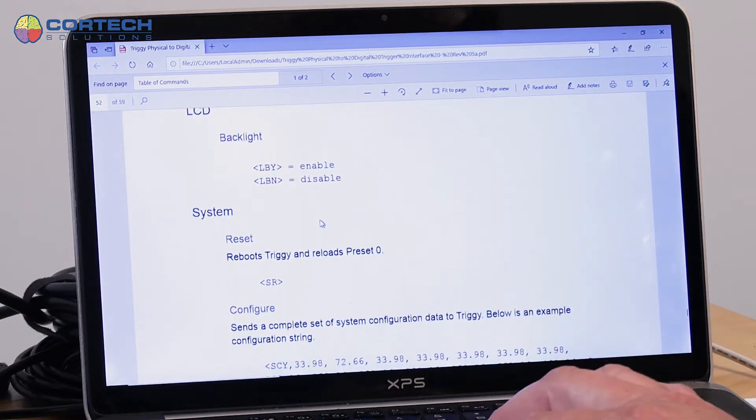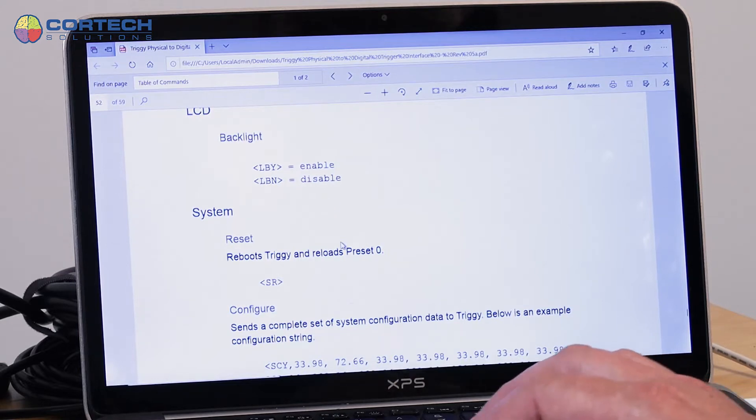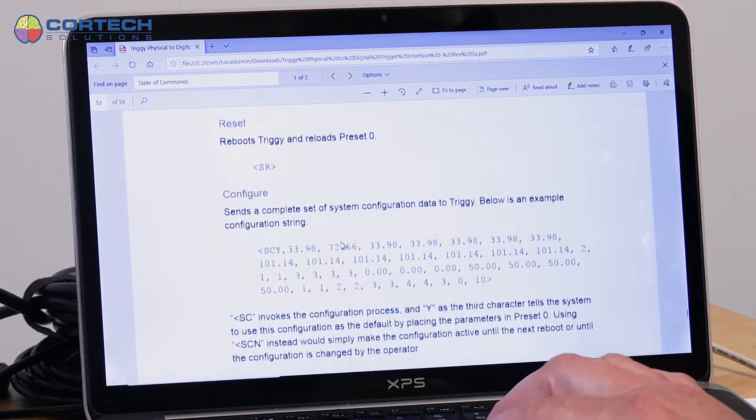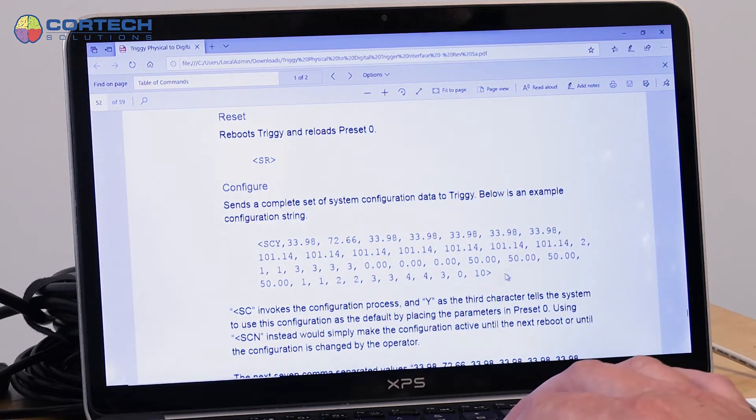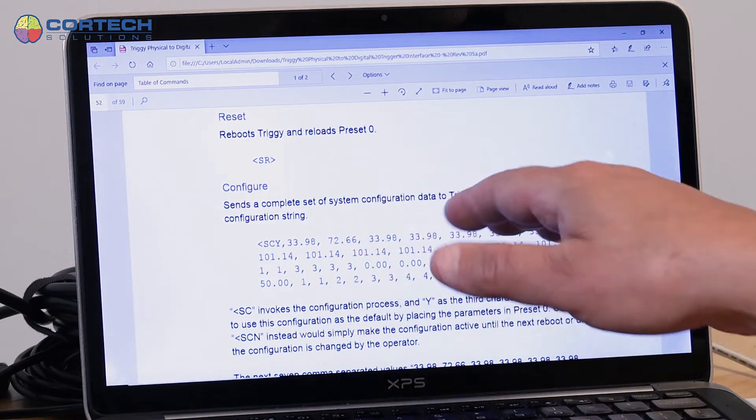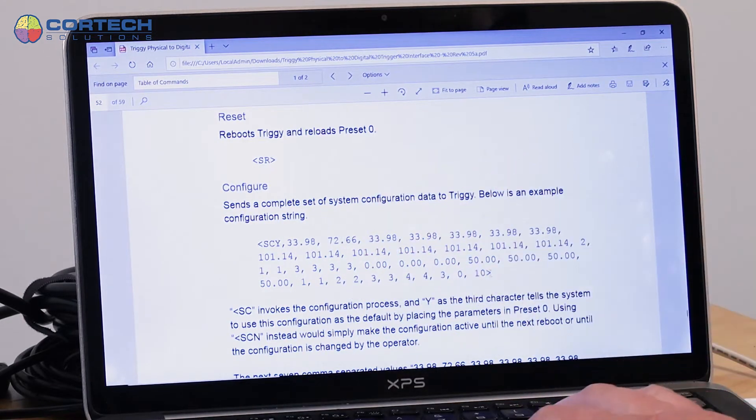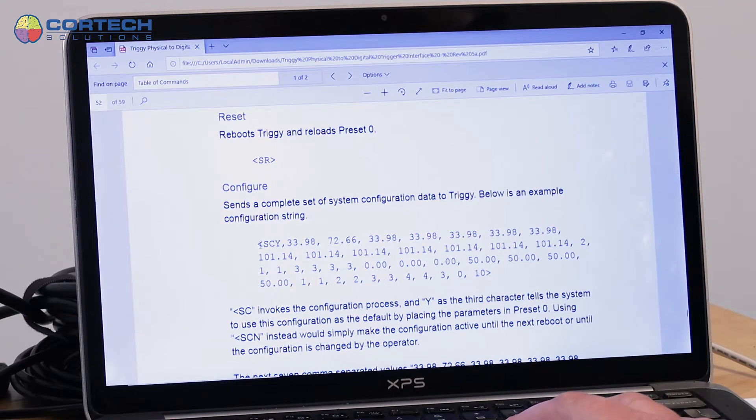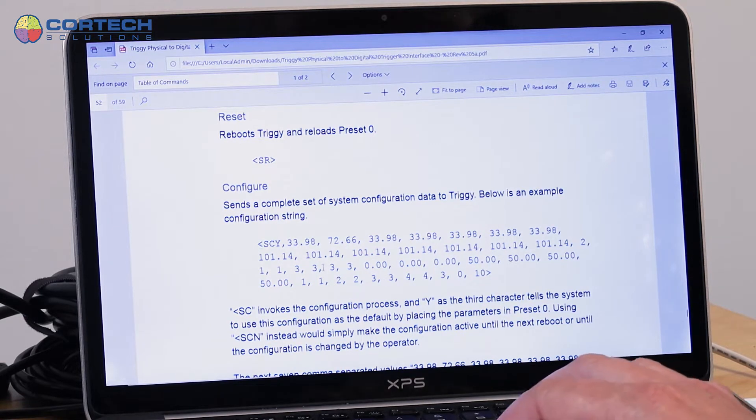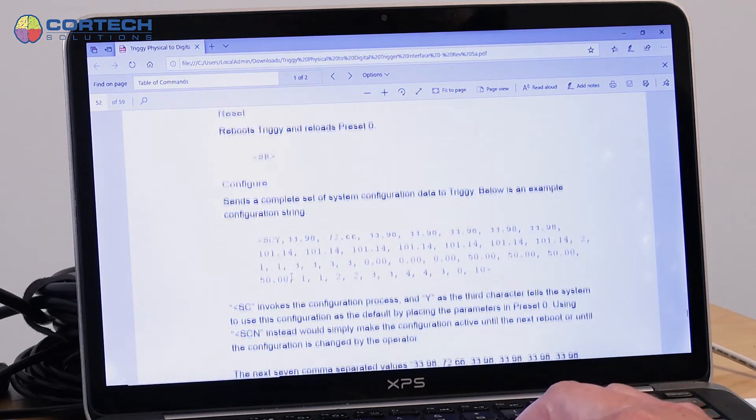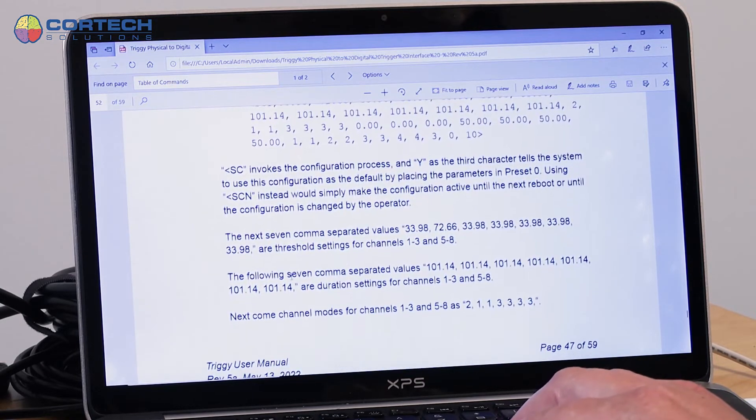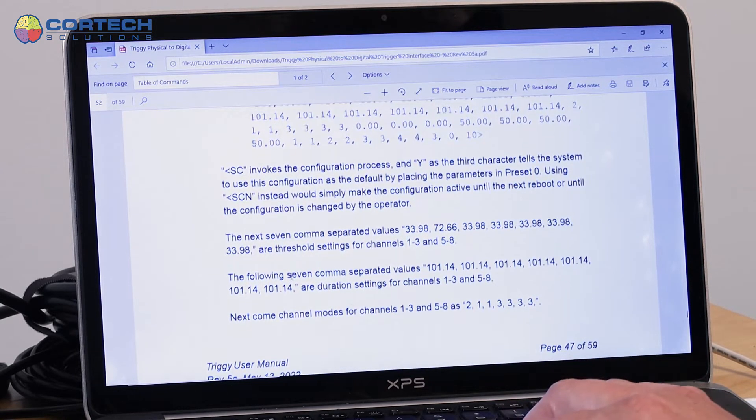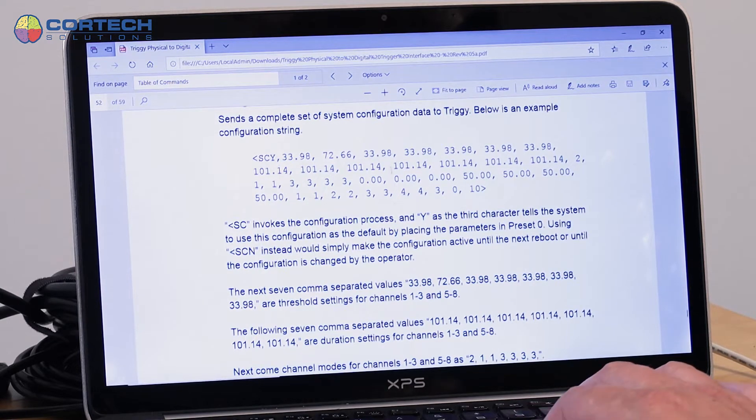Some of these other command strings, if you look at how long this is, there's a lot of information there and it would be hard to create that string, but it is possible to ask the system to send you a string that describes the current configuration. So we can ask Triggy to send back a string that looks like this, then we can edit it and send it back.